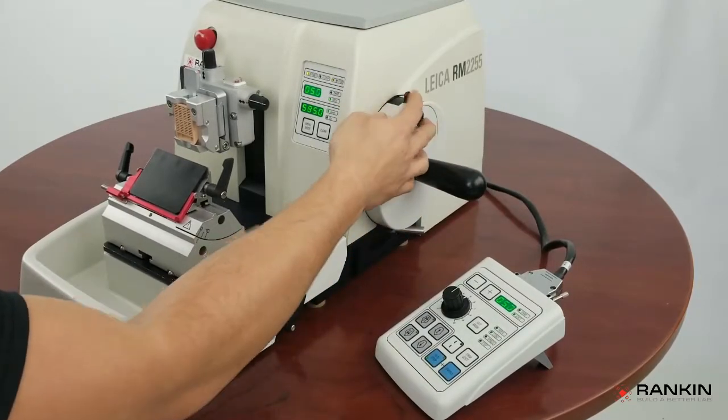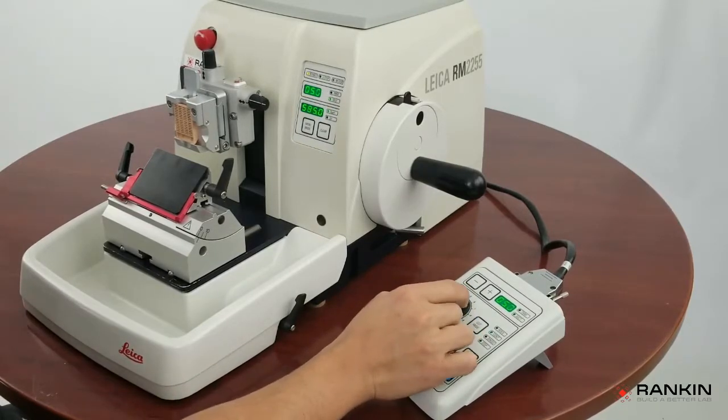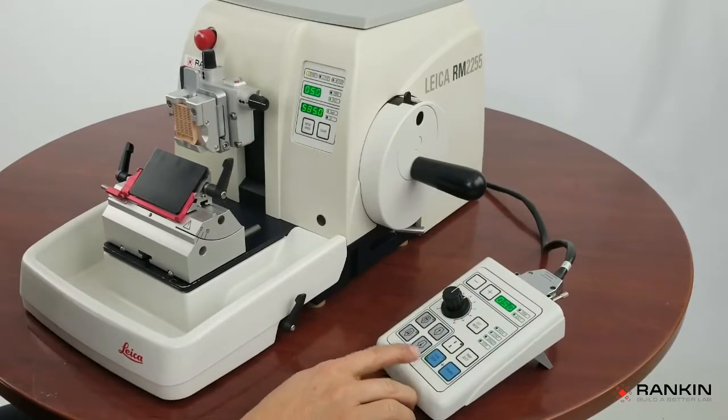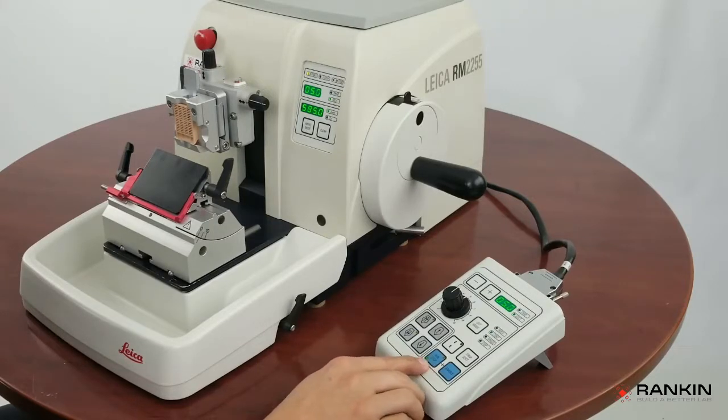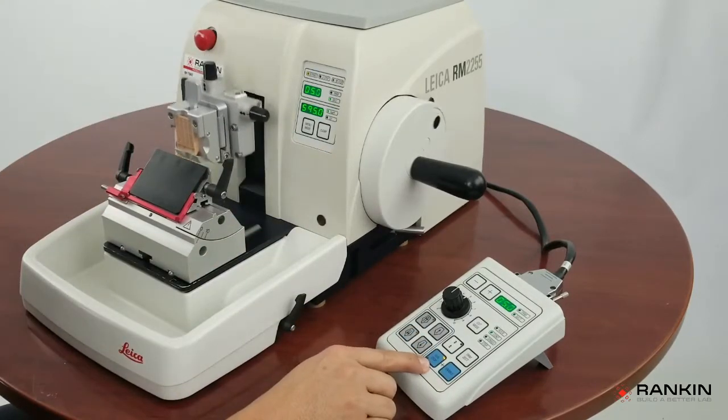When you're ready, you unlock it and come over here to set your speed. In order to get this going, you're going to press the run and enable button at the same time, and it will continuously move until you hit the run stop button again.